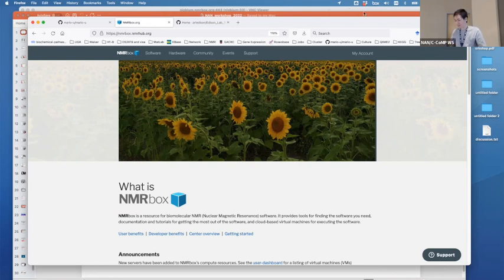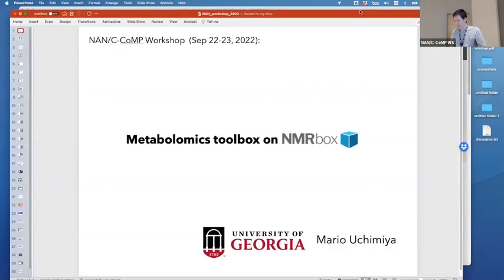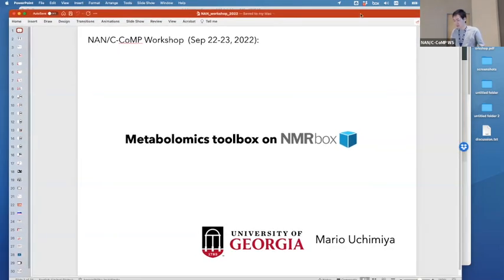Thank you, Art. I want to use slides and other homepage websites and NMRbox, and I will go back and forth. So I don't use the full screen.